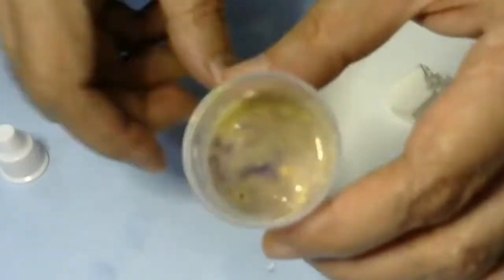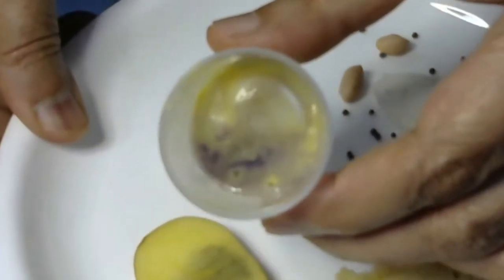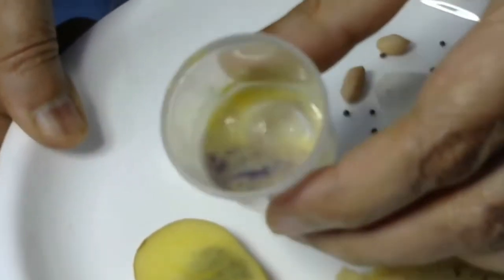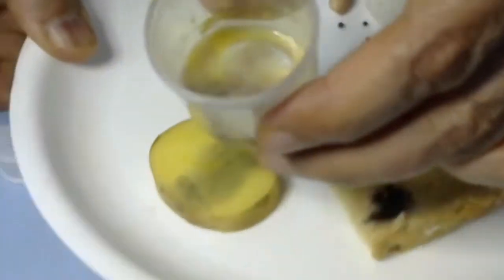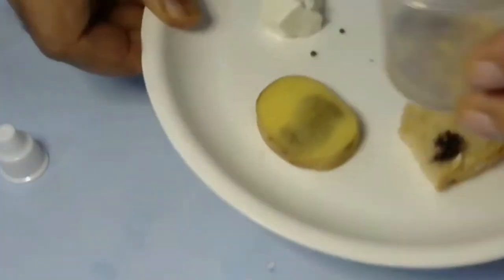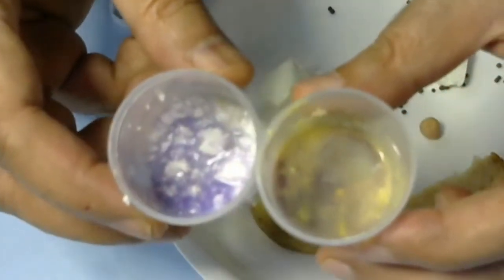If you look at the besan solution, this has also become slightly purple, but because besan was already yellow, the purple color is not very clearly visible. But when you do it, you'll see that it turns into purple color. This is a simple solution to see the presence of protein.